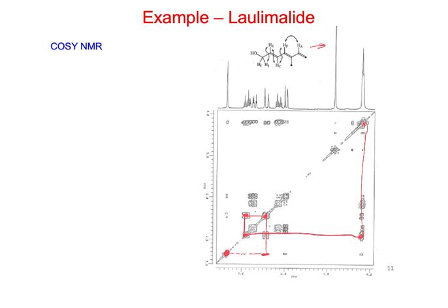So in blue, we could go to this other one, which goes into here. This goes into here. This one goes out to here. And then this would go also to the CH2s. So for this one, in blue, we started here. We went to here.